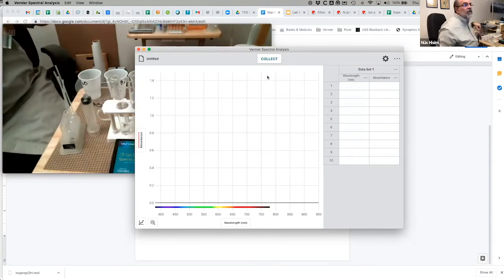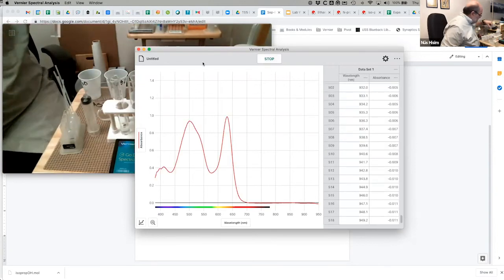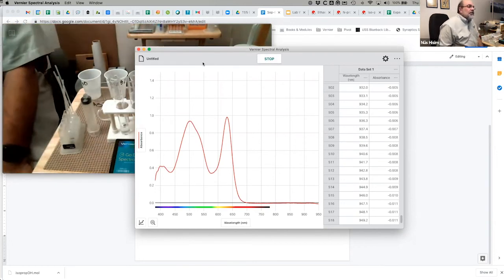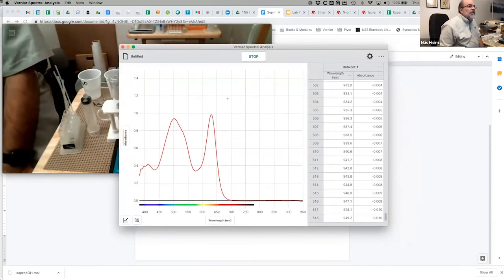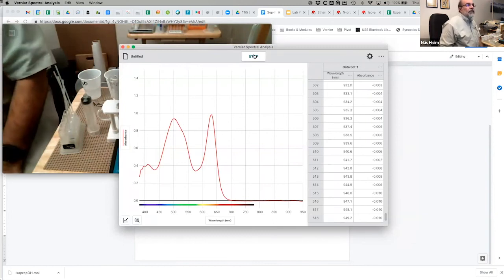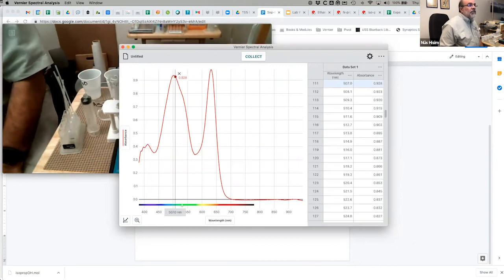and let's take a look at it. Depending on your preconceptions, this may or may not be obvious. And so we can look at this. This is just the straight up absorption spectrum of Kool-Aid, right? Grape Kool-Aid. And so we can actually find the lambda maxes here and see, there's a couple of things.